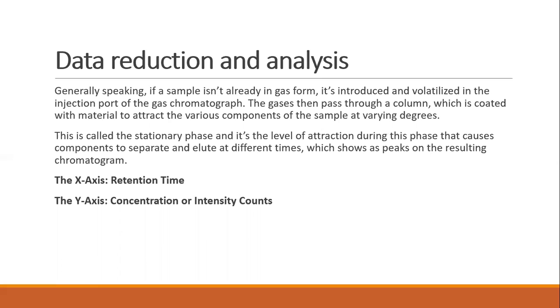And there is also another analysis called quantitative analysis, in which the area under a peak is proportional to the amount of analyte present in the chromatogram. By calculating the area of the peak using the mathematical function of integration, the concentration of an analyte in the original sample can be determined. Concentration can be calculated using a calibration curve created by finding the response for a series of concentrations of analyte, or by determining the relative response factor of an analyte.